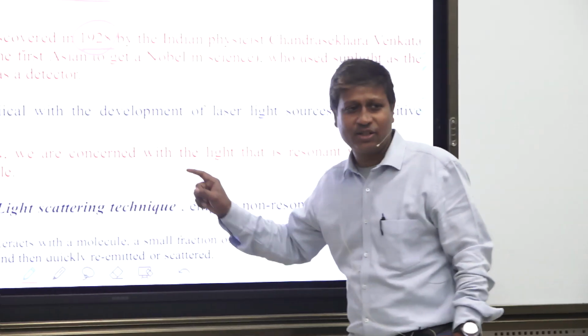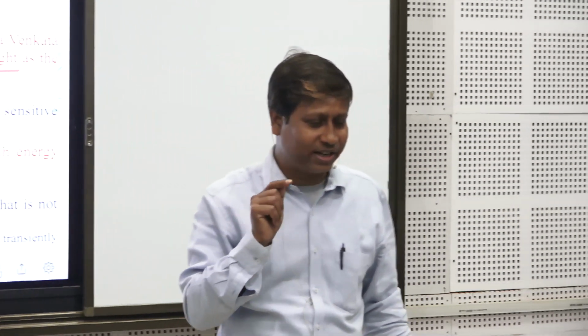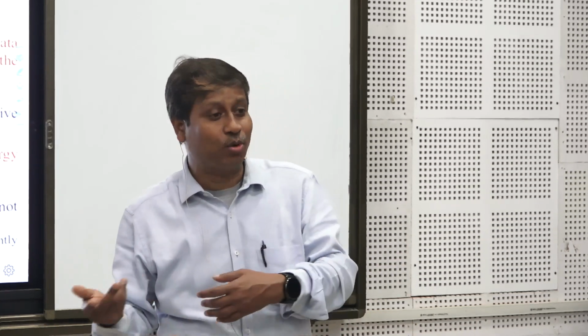Why? Because the signal that you get is very weak, and you need a strong excitation source and a good detector. At that time they were using sunlight or mercury light, which was not good enough to study many molecules.